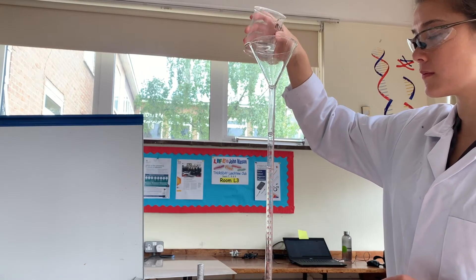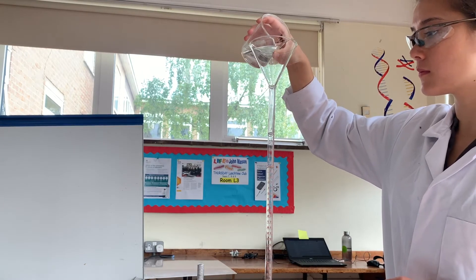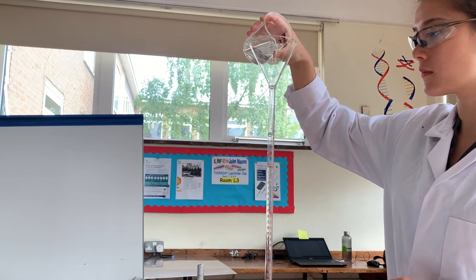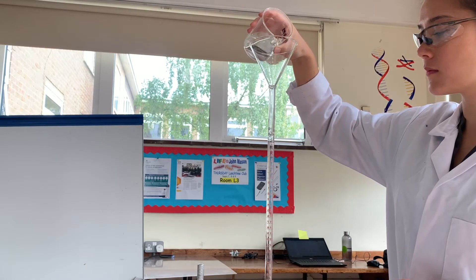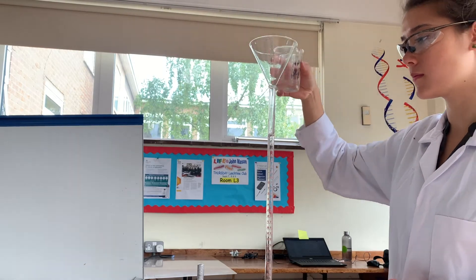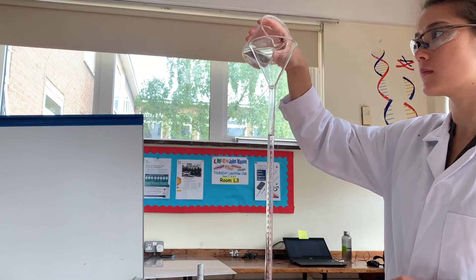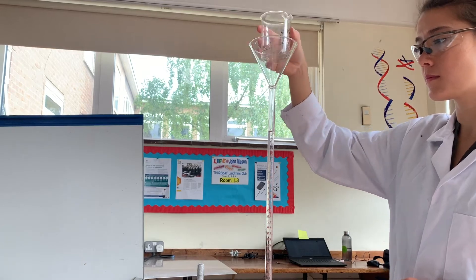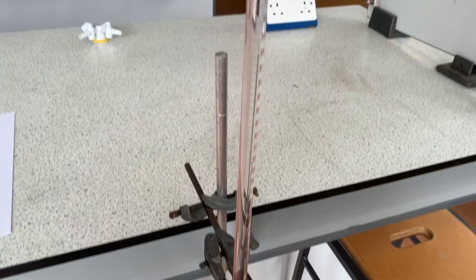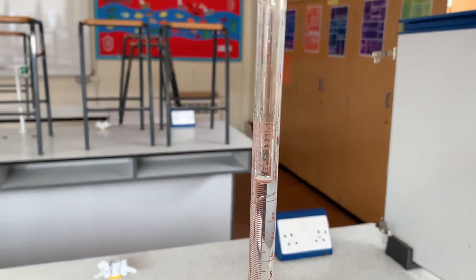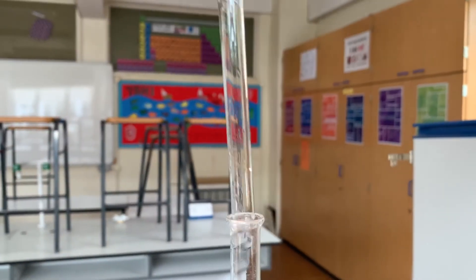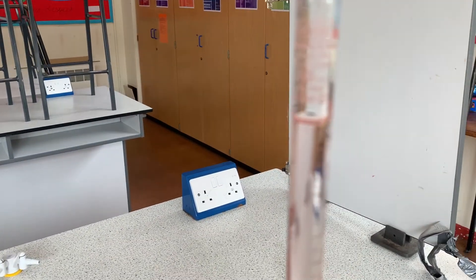You don't need to fill the burette until the solution exactly reaches zero, because you're going to record the starting and end points. Now that my burette is filled, I'm going to take the funnel out and read where the solution reaches.